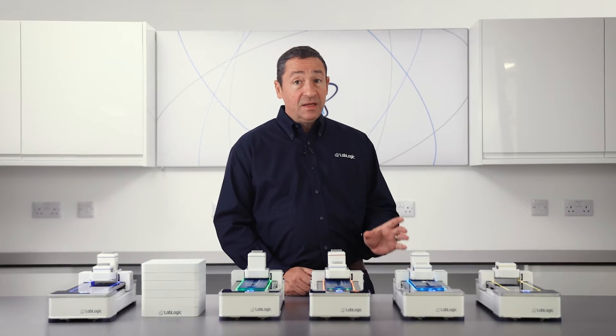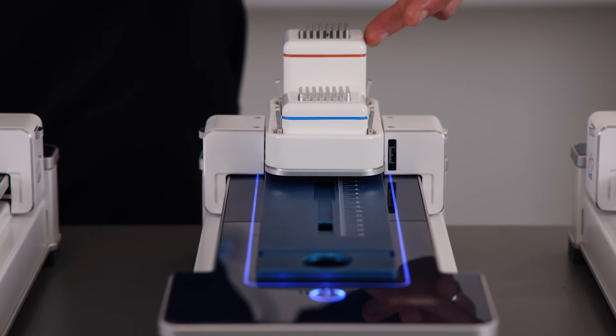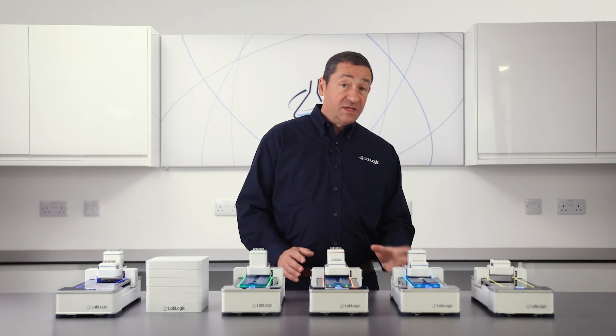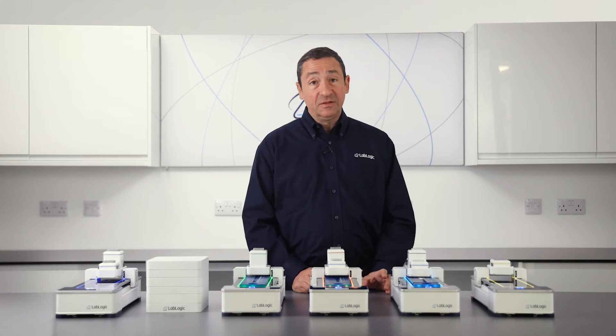The ScanRAM MCA is ideal if you want to combine radiochemical purity and radionuclidic identity in one system. This version includes a multi-channel analyzer detector with a dedicated detector.